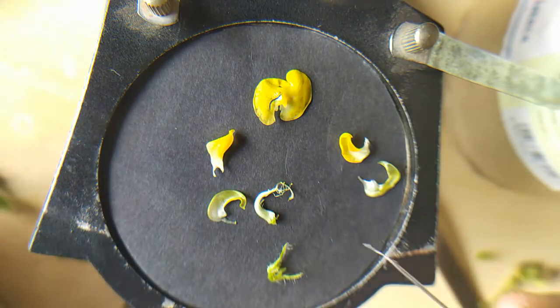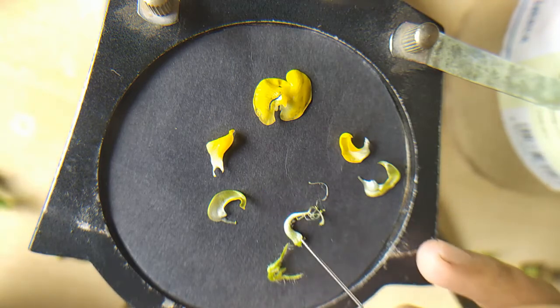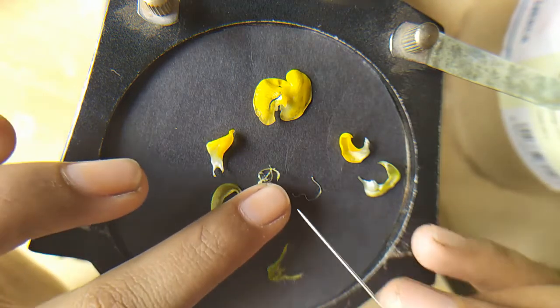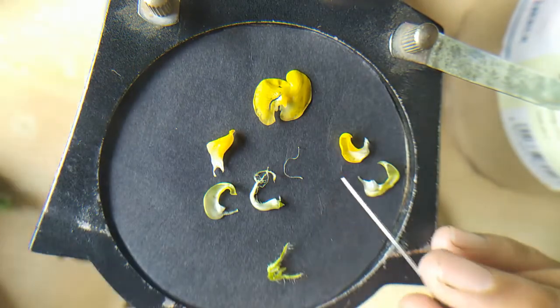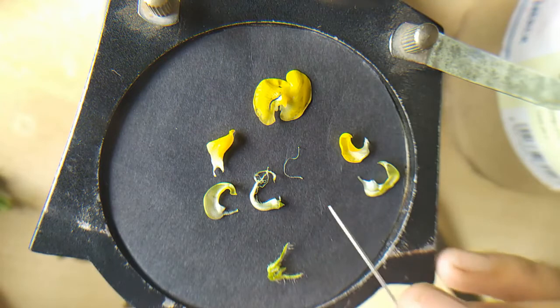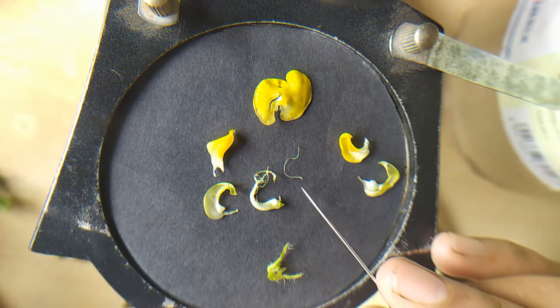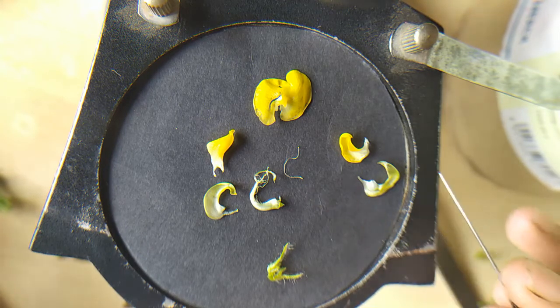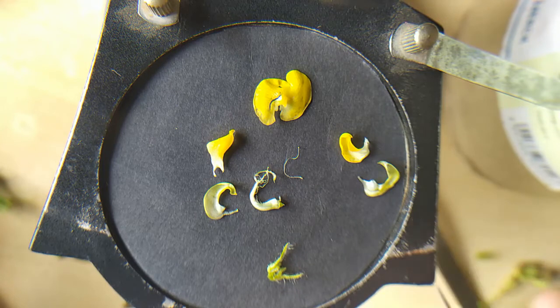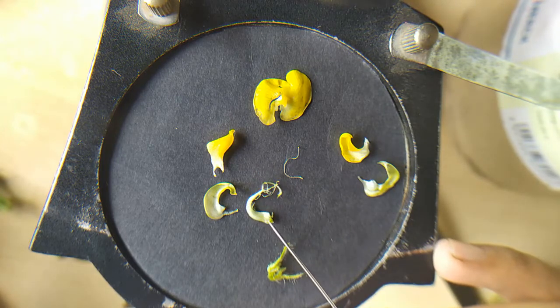Okay, it falls down. I have taken it from the base. The one anther is so thin that sometimes it gets attached to the keels, or sometimes to the calyx. So you should take care that it should not be removed with any other part like the standard, wings or the keels. It should remain with the bunch of 9 anthers.